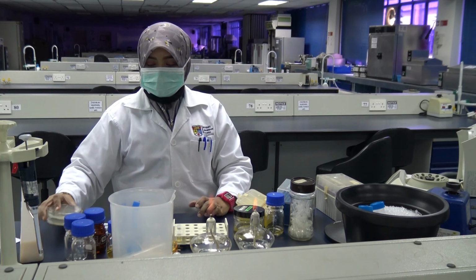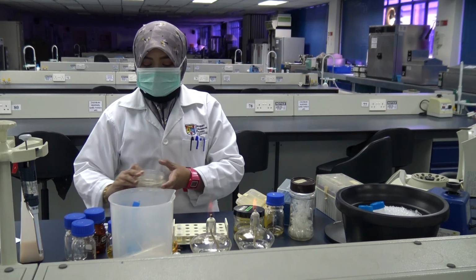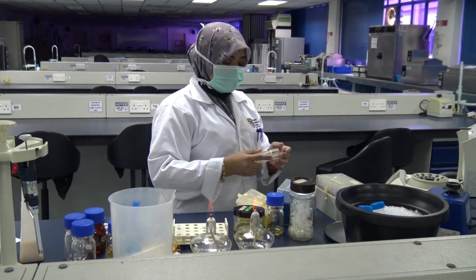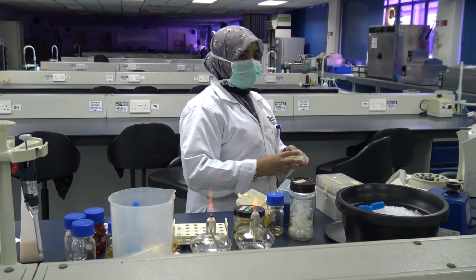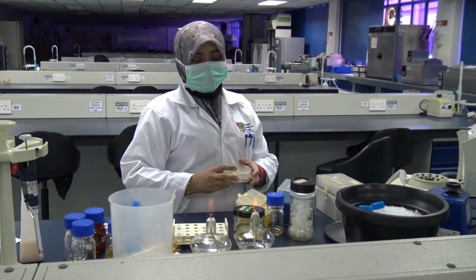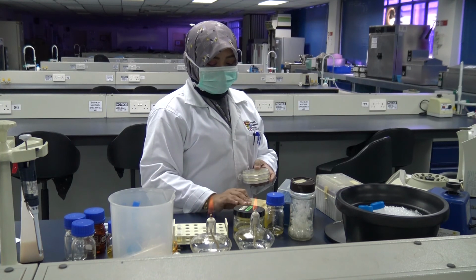So for the colonies that arise on the nutrient agar and ampicillin plate, you take the total colony forming units from there and divide it by the total colony forming units of the bacterial suspension, and thereby you will get the frequency of the spontaneous mutation.